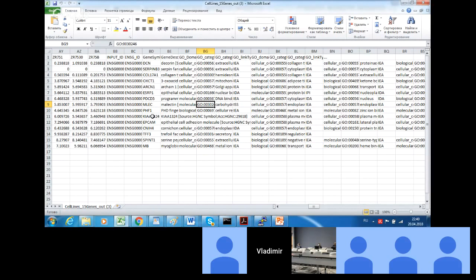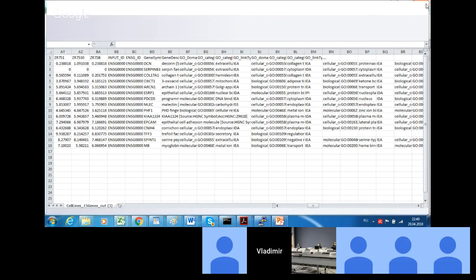The annotation module simply does this job. This annotation module was applied to our output of differential expression analysis, and gene names were added simply because certain gene set enrichment analysis tools work perfectly well with gene symbols, but not with Ensembl gene identifiers.